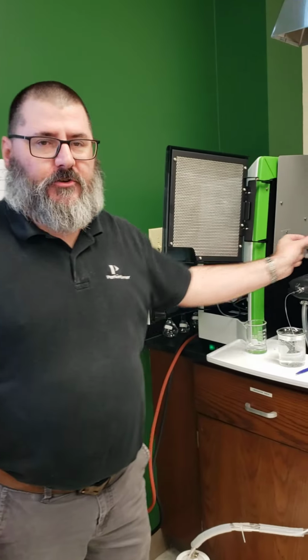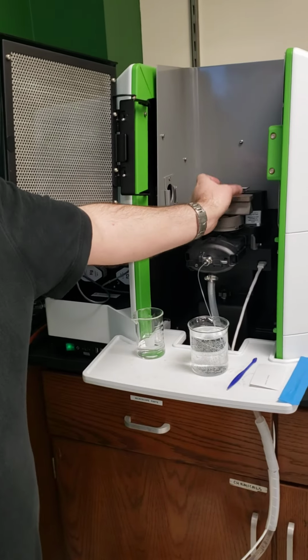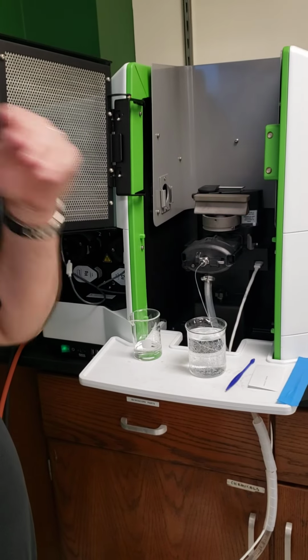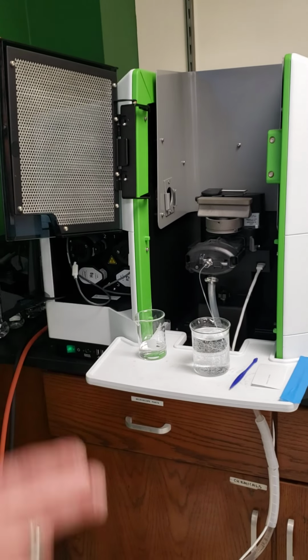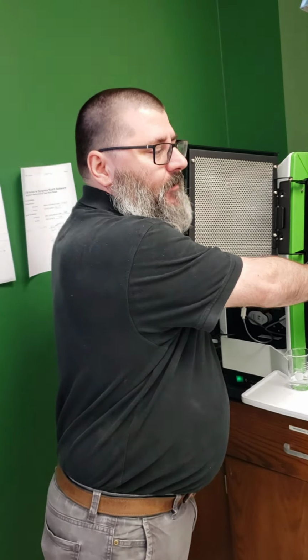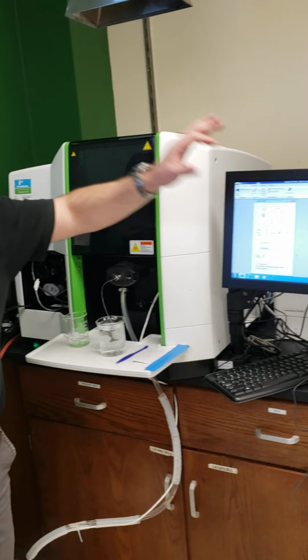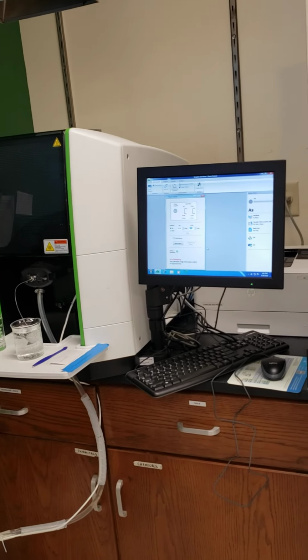So the photons, it's really quantum mechanics. It has to be that exact energy for it to be absorbed. So the exact energy of the photons leaving this copper will be the exact energy absorbed by copper in the flame. So the photons will be absorbed in the flame. You can look at the absorbance of how many copper atoms are in the flame using Beer's law. This is an absorption cell, to give us an absorbance and a concentration. So that's kind of the gist of how it works.